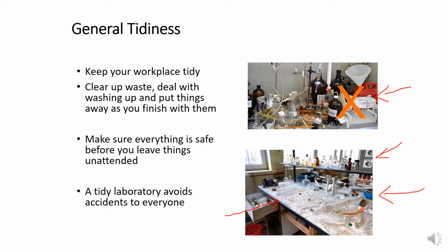If you use anything and you just leave it there, then the other people who are working can get hurt. Sometimes you cannot see some glassware or some chemicals, so there are chances of spillage or breakage of the glassware. So this is general tidiness, even while you are reading or writing. You should keep your papers and everything with you while you finish your work in the lab.